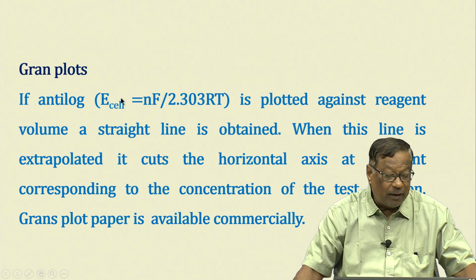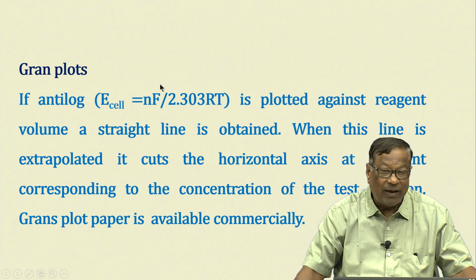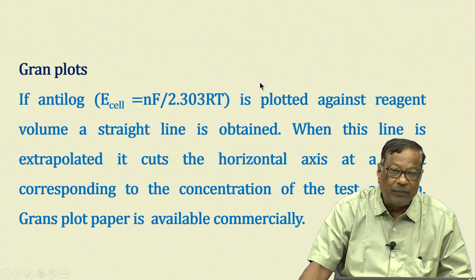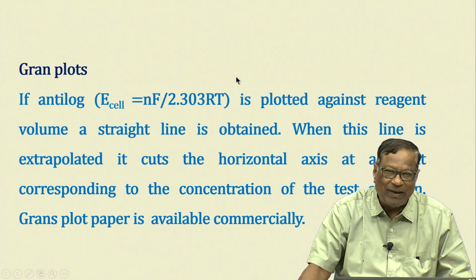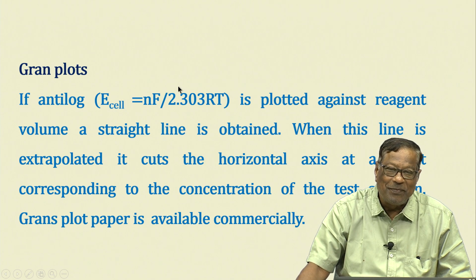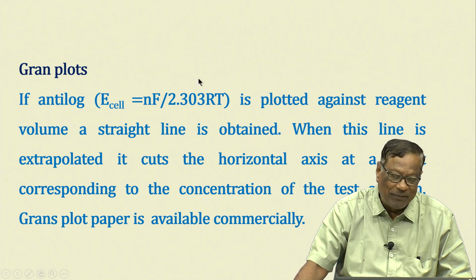So, now I want to describe to you what is a Gran plot. A Gran plot is a very simple system of measuring the RT by nF value, that is the slope.